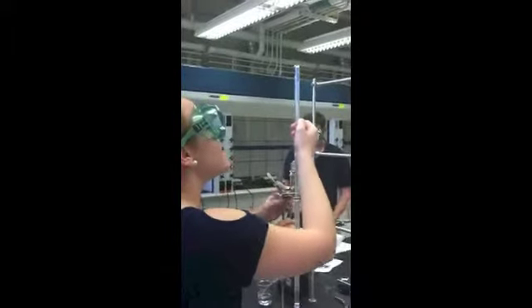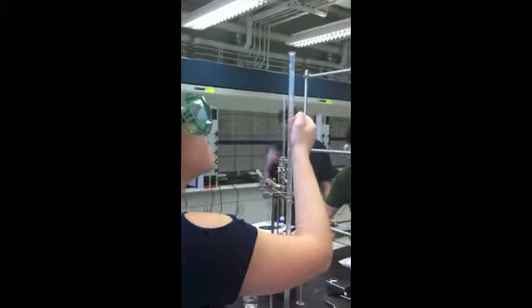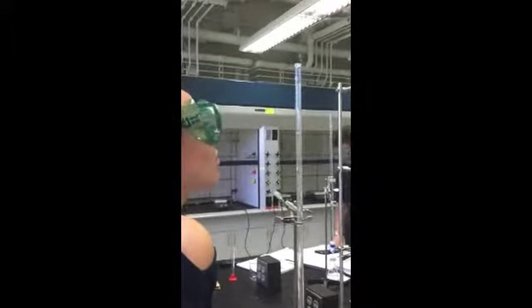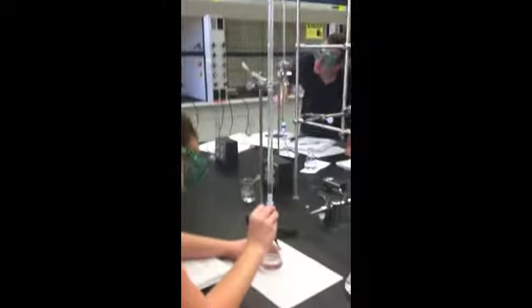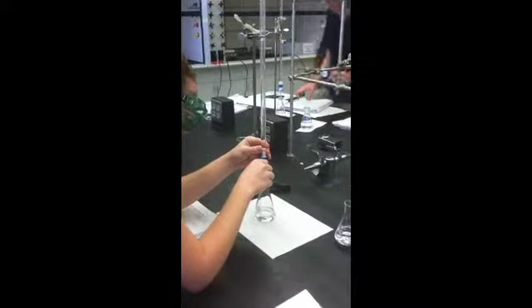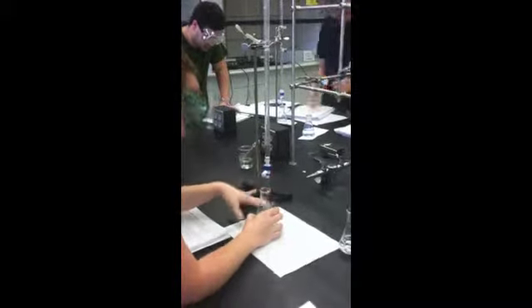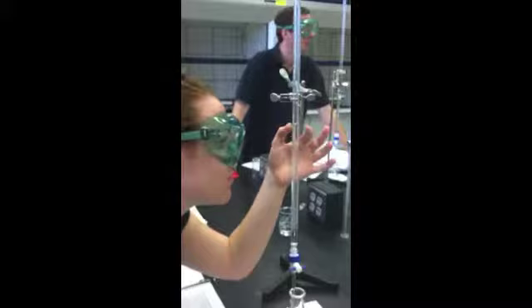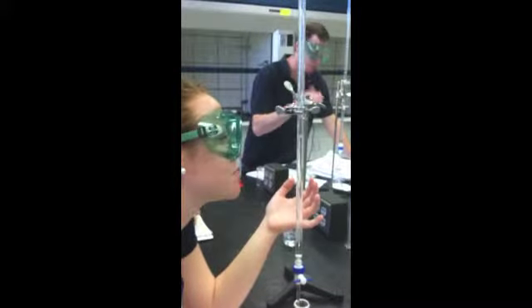Now we'll see Morgan doing the same thing, taking our initial. Now she will release some of the NaOH and then gently swirl the flask to mix it in. And she will continue doing this slowly until the mixture turns a light pink. That means the indicator is showing that the reaction is through, which means that now we can calculate the molarity of what we need to know. There she's taken the final volume.